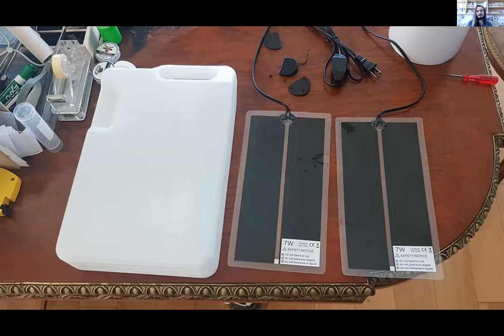They came in, so I looked at the bottle. I'm just like, okay, this is 5 liters to the very top, but the very top is the opening and I need a foam stopper because I need the air to come out somewhere. So I decided on 4 liters, which is perfect because that's what my client needed. So I slapped these heating mats onto the bottle and turned it on. I thought 7 watts would be enough, 7 watts on either side, 14 watts total. And it ended up being terrible.